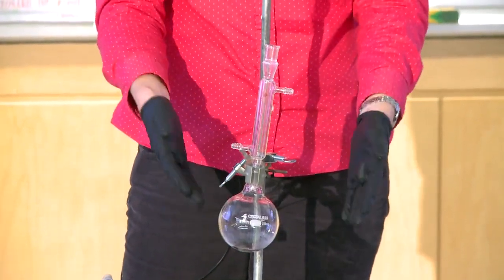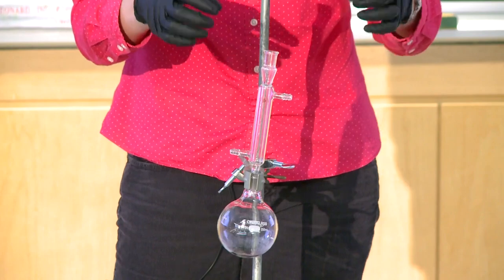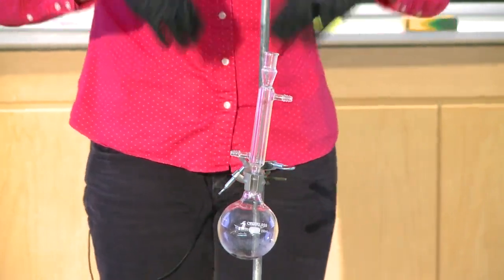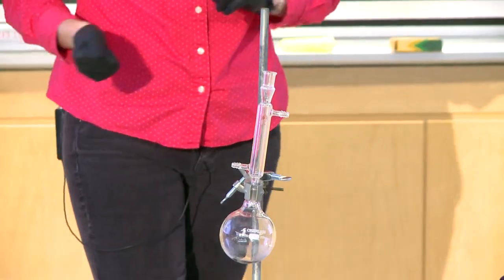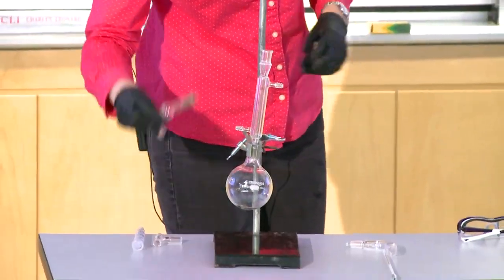cold water. And so when you're boiling, your solvent will be evaporating, and then it'll condense and go back down so that you don't boil to dryness and you don't lose all of your product as you're boiling it. And then on the top, you're going to put a drying tube.